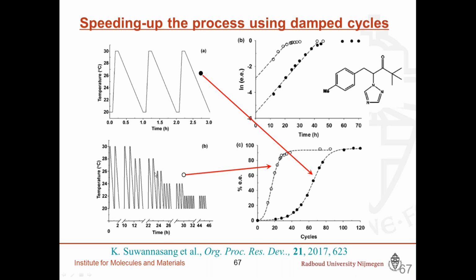Later on, they also showed that if you want to increase the speed of this deracemization process of temperature cycling, then you can also reduce the temperature difference during the process, and then you can decrease the deracemization time considerably. So you can play with this profile very nicely, and in general, not always, but in general, temperature cycling is fast anyway, a little bit faster than Viedma ripening.